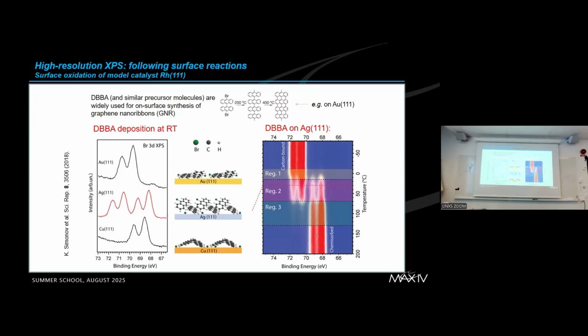As I mentioned here, for example, if we are speaking about simple molecules and we are measuring oxygen, carbon, nitrogen 1s lines, then the Lorentzian widths are known. They are between 100 and 150 millielectron volts. So you would fix this as a parameter in your fit procedure. You would not allow it to go to 300 or to 1, right? So you will always try to fix the intrinsic width to a certain reasonable value.